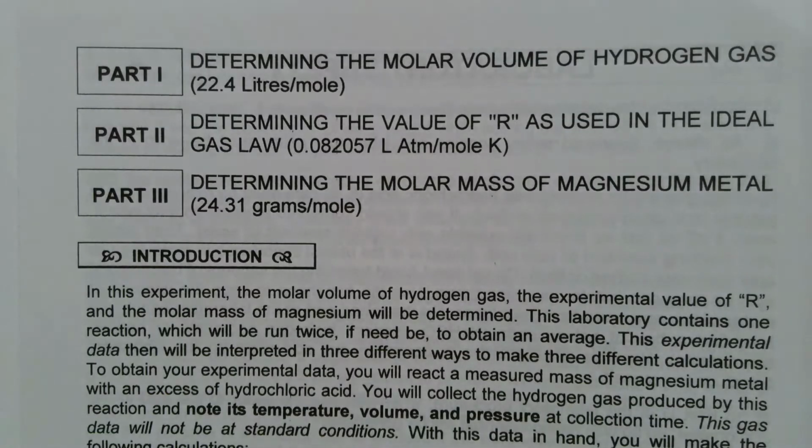In today's experiment, you are going to determine the molar volume of hydrogen, which is 22.4 liters per mole. I hope your instructor has informed you that any gas has a molar volume of 22.4 at STP conditions, whether it's hydrogen, oxygen, helium, whatever. But it has to be at STP conditions. Now, the 22.4 liters is approximately the volume of 3 basketballs.